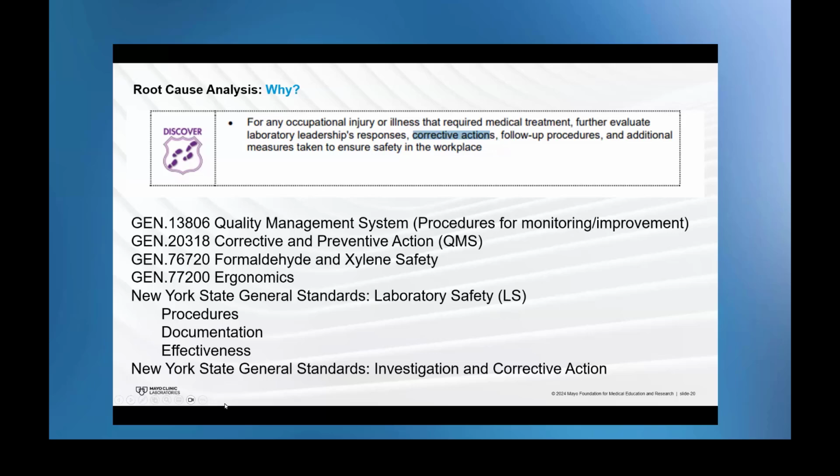The checklist items I have listed below are a few that have the words corrective actions embedded in them, which are mostly addressed by the completion of a root cause analysis. If your laboratory performs testing for the state of New York, regardless of being inside the state or away from the state, they too look for procedures and documentation of root cause analysis. They also ask to see whether or not your corrective and preventive actions are effective. That's really where it's at, is what you planned to do to prevent really doing its job.